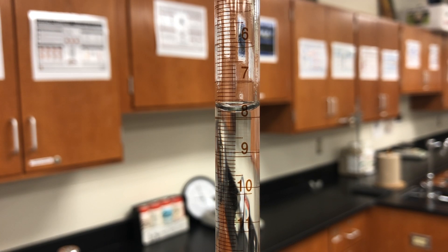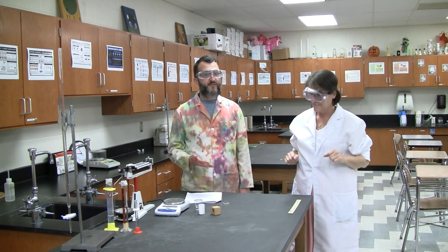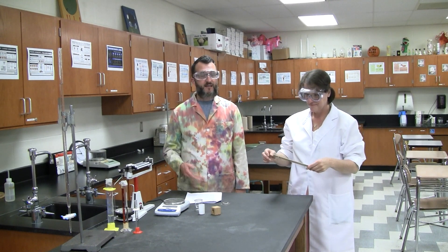Next we'll take a look at a buret. A buret is read a little bit differently than a graduated cylinder. Unlike a graduated cylinder, a buret measures the volume dispensed, not what it holds. Notice at the top of the buret it measures zero and at the bottom it measures 50 milliliters. The scale of a buret increases as you go down — it's like the numbers are reversed.